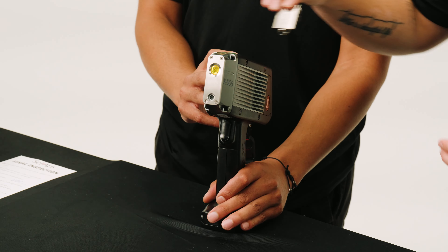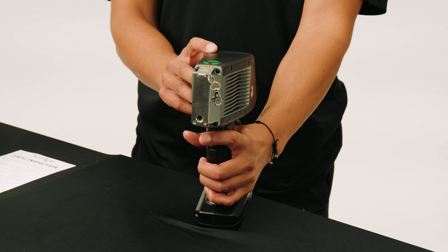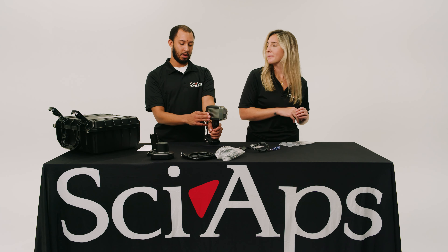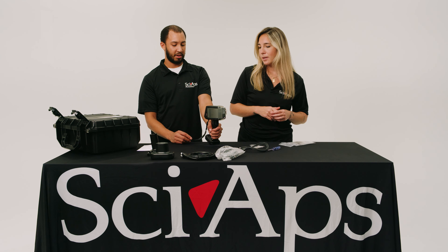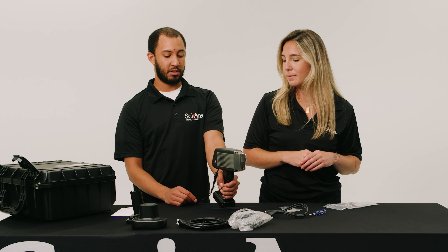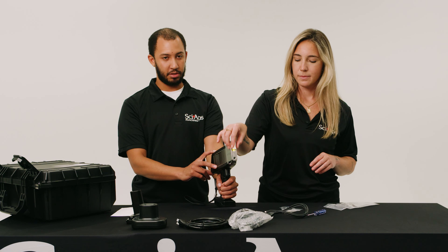Grab your 316 calibration clip, put it right on the front of the unit, and then you can either pull the trigger to calibrate or press calibrate on the screen itself. This usually takes about 30 seconds — it takes 15 shots. Once those shots are over you can start using the analyzer however you'd like. Once they're done you'll see that it says calibration complete and you can go forward.